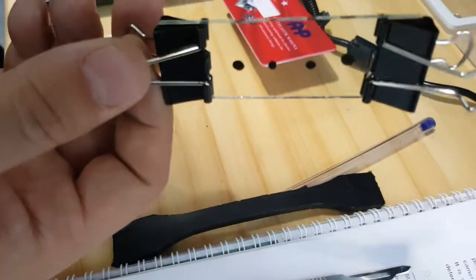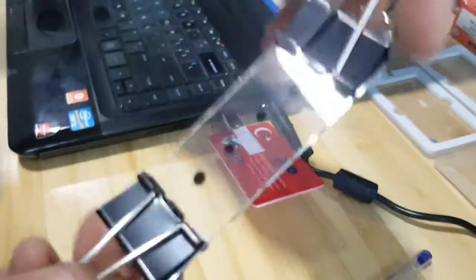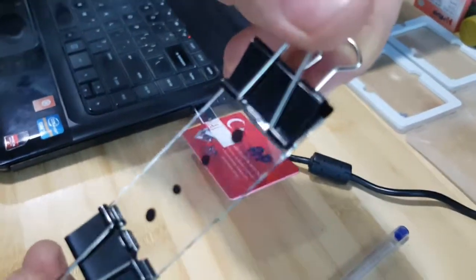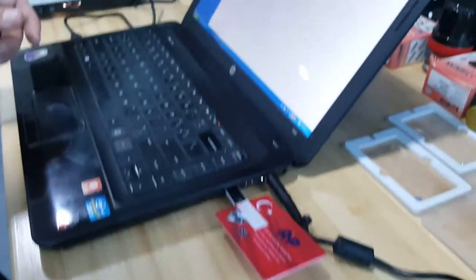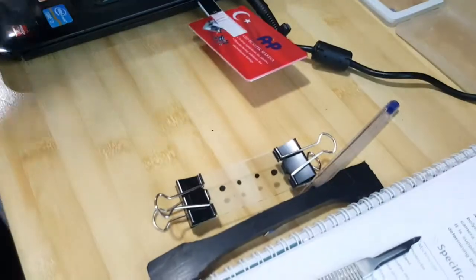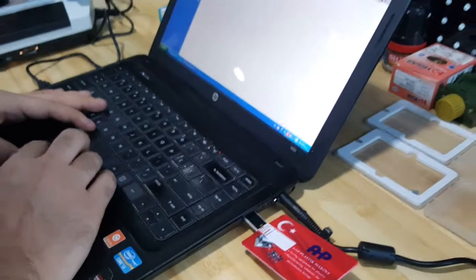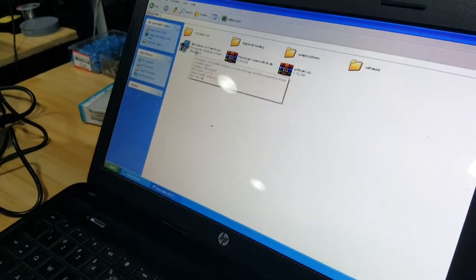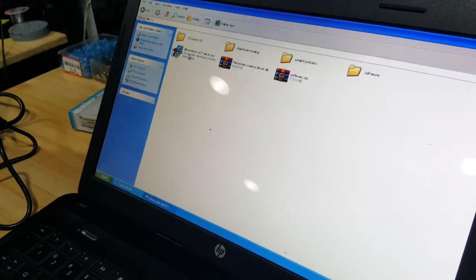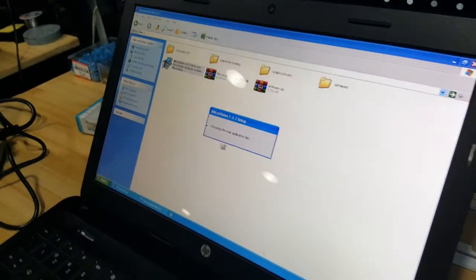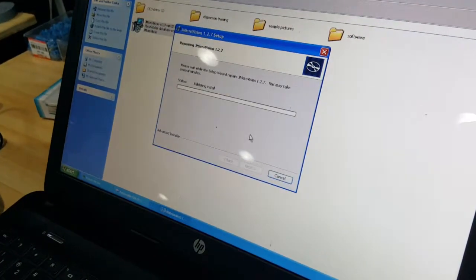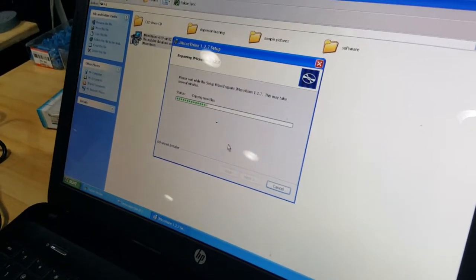Samples are just prepared after putting them for about 15 minutes in the oven at 150 degrees centigrade. We will have samples ready for analyzing. Now I'm going to install another analysis software called J Micro Vision. You will find the file on the flash disk of the microscope — just install this software.